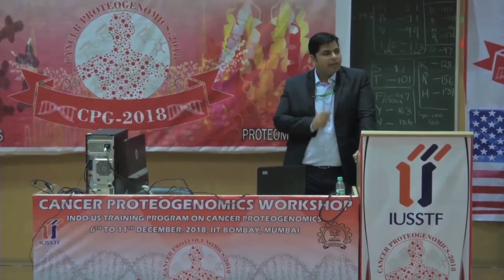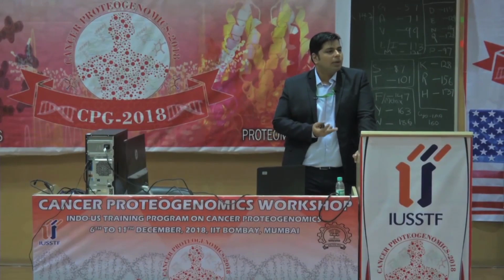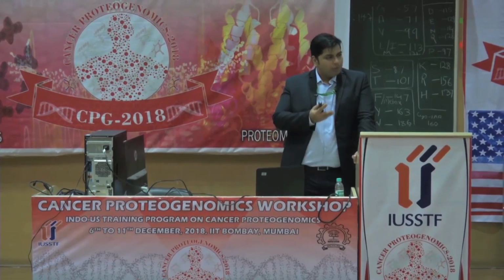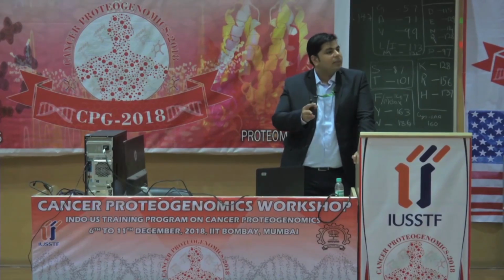So the data that comes out comes after applying a Poisson algorithm, which takes care of your statistical significance. From the publication perspective you are asking, there are more than 4,000 publications already with this technology where this direct analysis has been done.